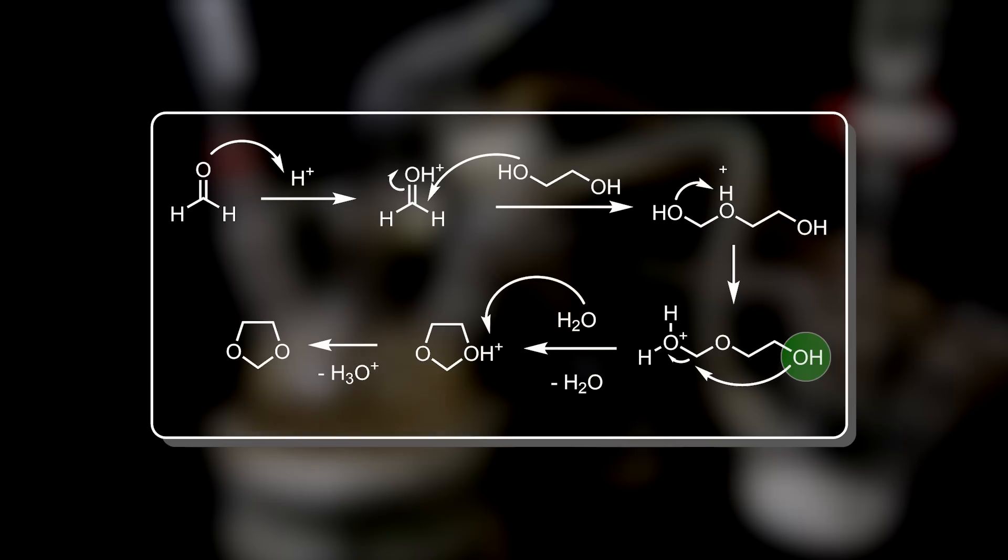The other hydroxyl then wraps around and attacks the carbon adjacent to the protonated hydroxyl, which is kicked off as water. We are then left with a protonated 1,3-dioxalane, which is deprotonated by another or the same water molecule, restoring the acid catalyst and giving the final product 1,3-dioxalane.